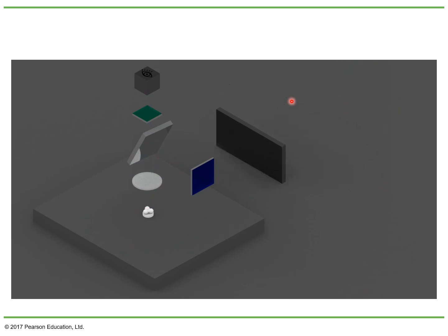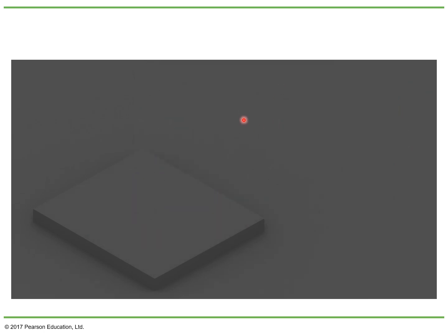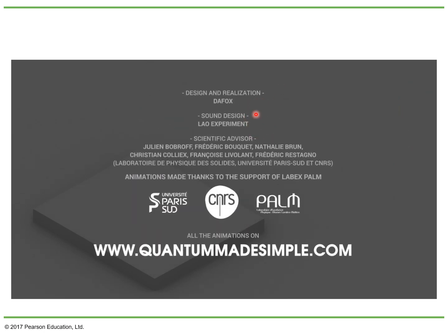It will give you not a 2-dimensional picture but a 3-dimensional picture, but it has benefits and it has disadvantages. Better resolution, but this picture will take much longer to take.